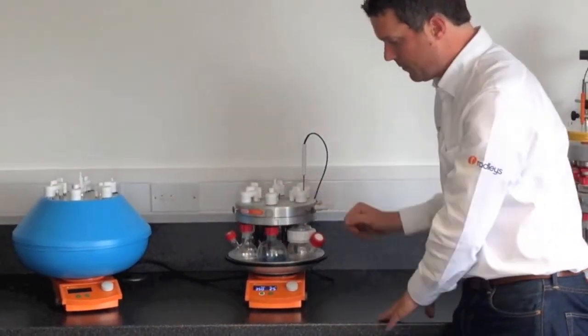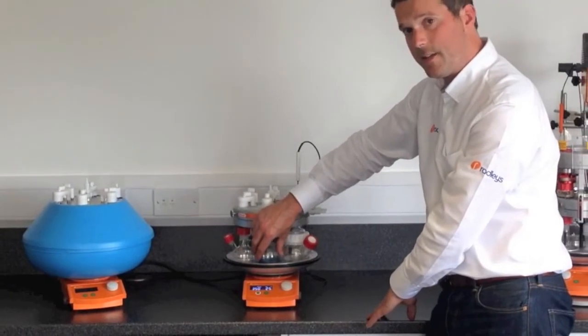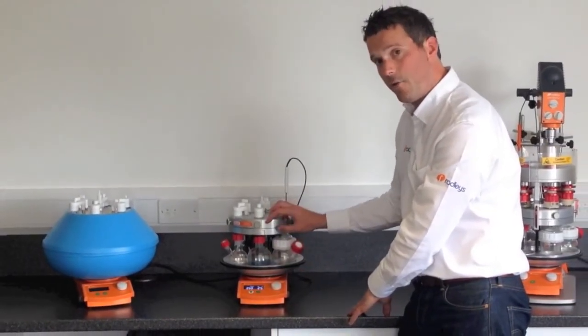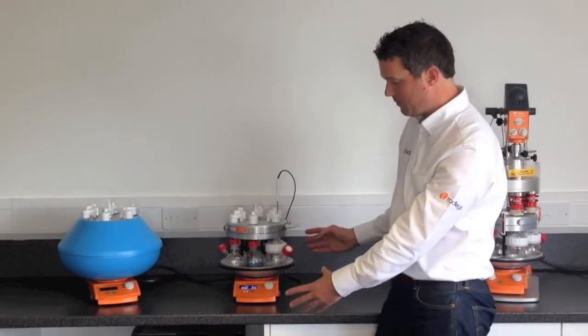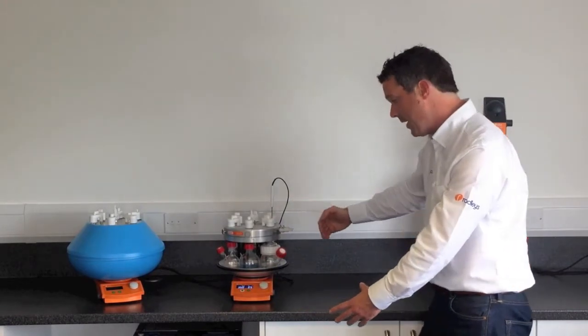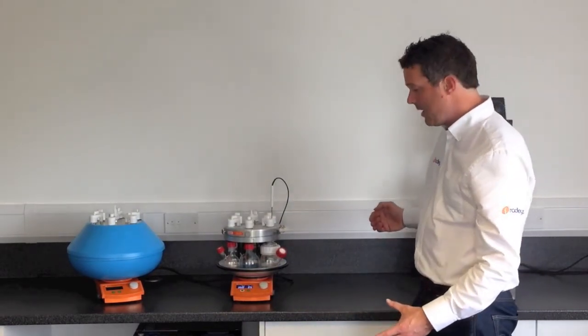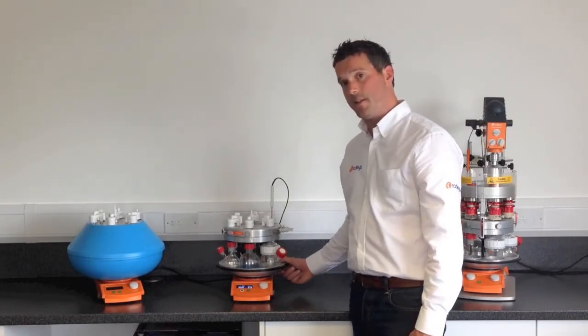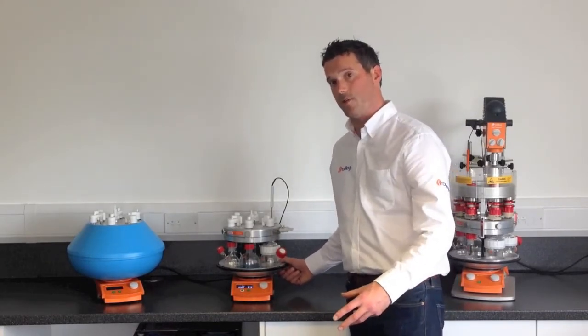So that's it — you've got six positions heated, cooled, and stirred simultaneously under an inert atmosphere. This saves a lot of space, because otherwise if you've got six flasks set up on a hot plate it would take up a lot more bench space. It also guarantees that each one is at the same temperature and being stirred at the same speed, so they're all under exactly the same conditions.